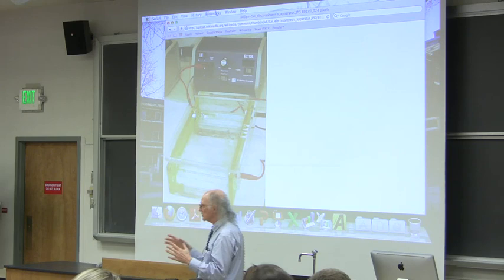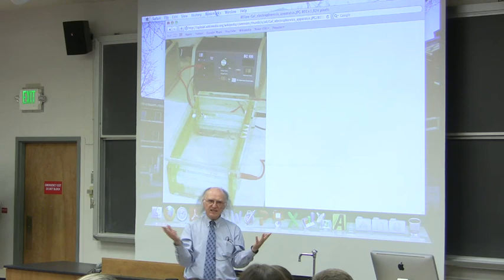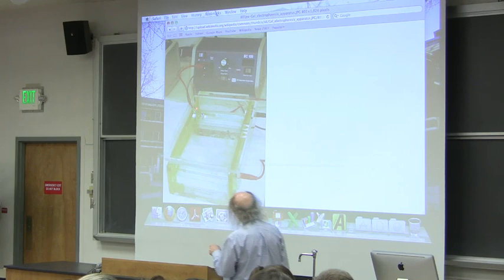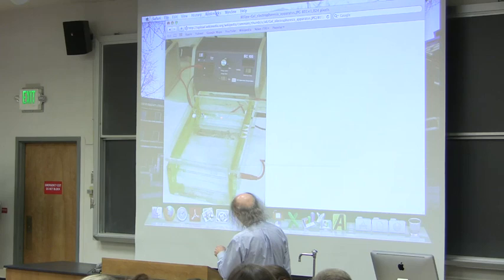I'm going to talk first about DNA. I haven't been talking about DNA, but I'm going to talk about DNA because it's the easiest to understand. DNA is negatively charged. It's also a long rod. Okay? With an agarose gel, I can put at the very head of it, right here, you see that little blue color right there? That little blue color is an indicator where they've put their DNA at the very end of the gel in what's called a well, just a little chamber to put the DNA into.